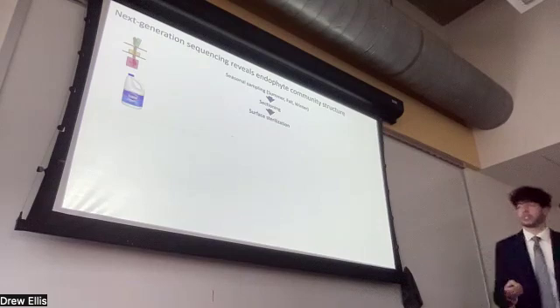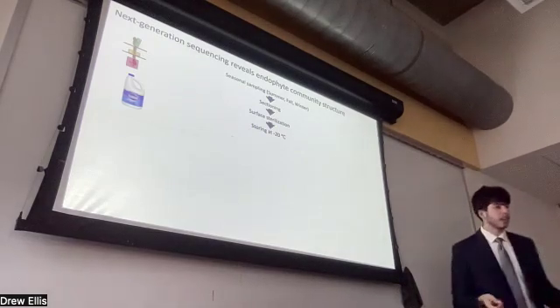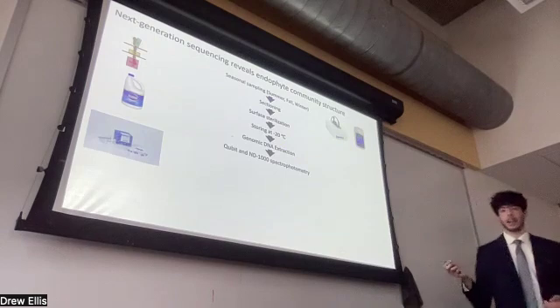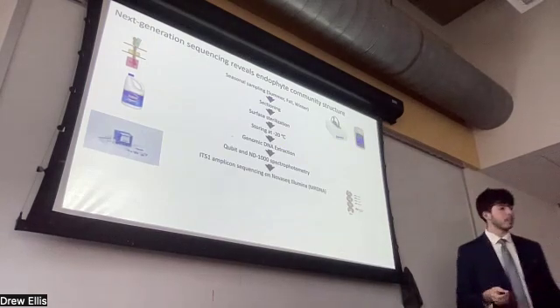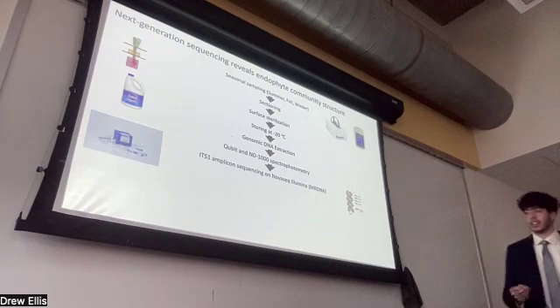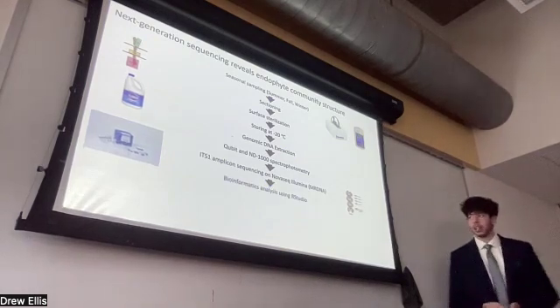And then we also performed surface sterilization at the same time in the same way. Often I had to store it and freeze it until I could actually extract genomic DNA. I quantified the DNA content and estimated purity just to make sure it's within acceptable ranges for sequencing. Sent it off to someone else to do it for us. So they did ITS1 amplicon sequencing using NovaSeq 6000 platforms.